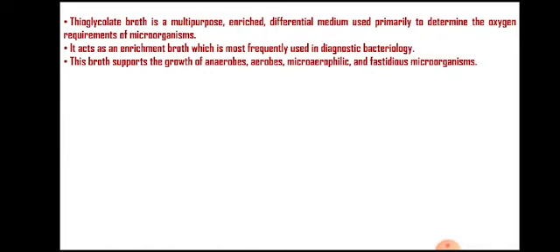Now the thing is that thioglycolate broth is a semi-solid medium which is used in sterility testing in order to check the growth of anaerobic bacteria.